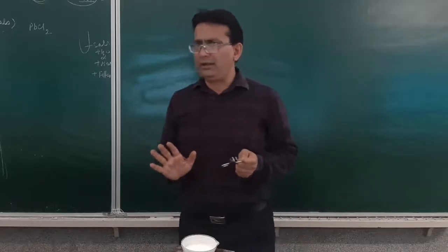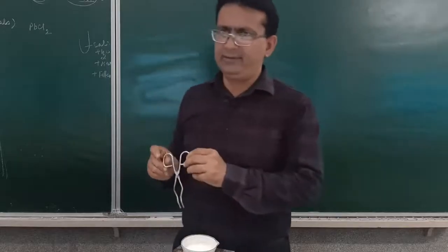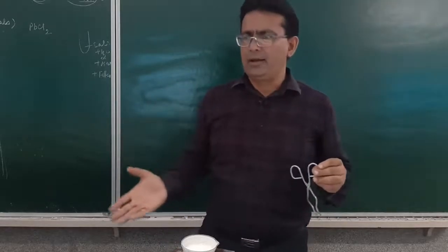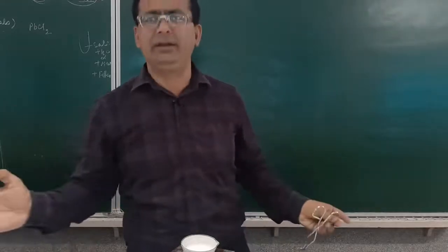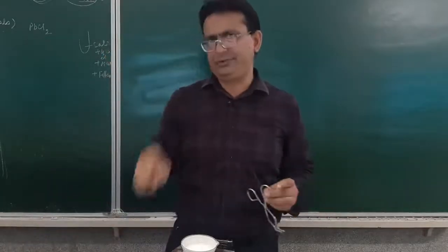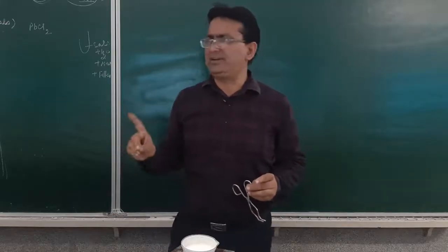Am I clear? You have to carry out the practical with utmost confidence. There is nothing in this. Then once it gets heated up, I will filter. The residue for the anions is to be discarded and the filtrate will be called the sodium carbonate extract. It is in that filtrate I will be carrying out the test.